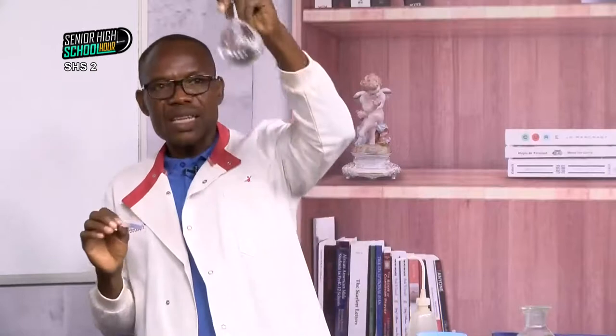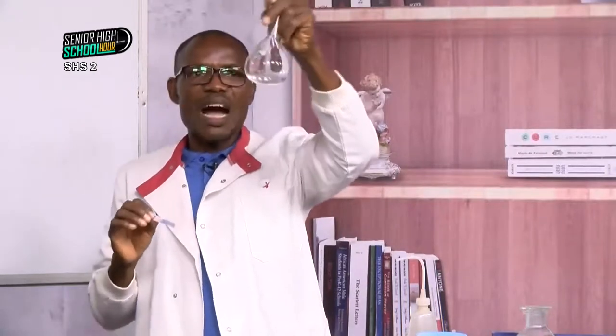So there is a substance. That's why you must not drink colorless solution in the lab. Look at it, just like water. If you come and say, oh, I'm thirsty, and you grab this, see what you are drinking. You get it. So take note, there is a chemical substance in it that has caused the change.